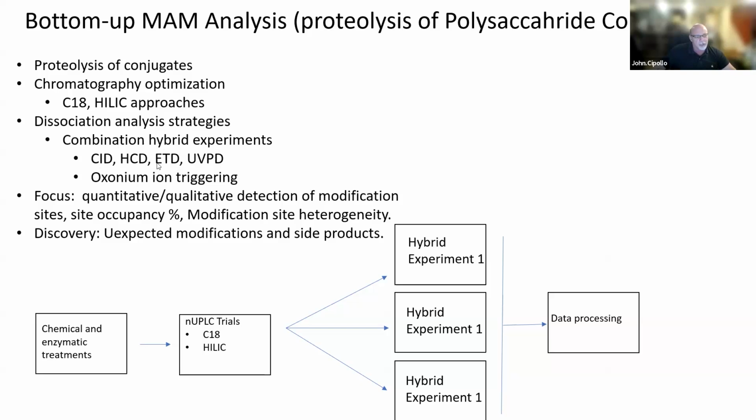For instance, in ETD, electron transfer methodologies, you're basically generating a cascade where you're particularly targeting the peptide backbone. And UVPD is a higher energy application, which would be useful predictably in the top-down application. I won't get too far into this more, but we're entering into this. We're hopeful that we can develop some techniques that will help in this subclass of products.